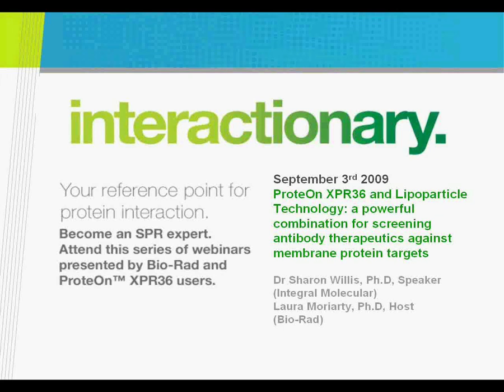Because the whole idea is, if you want an efficient capture assay, you've got to be able to immobilize quite an amount of your capture agent, and therefore have a great capacity on your chip to capture and retain. Because no matter what people think, there's always some dissociation going on.